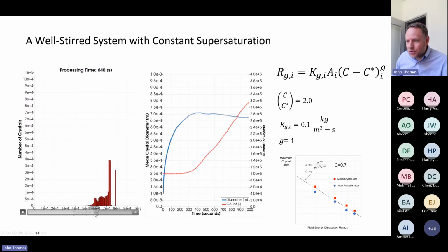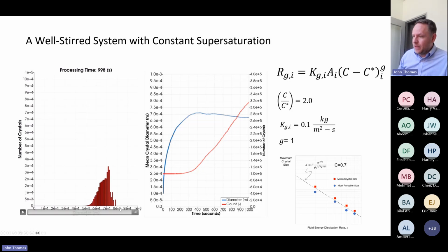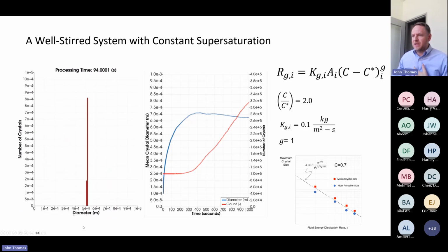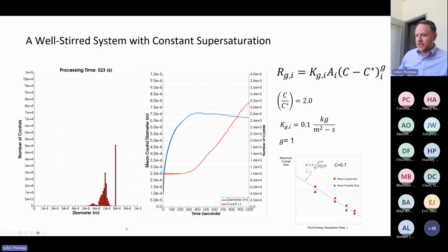And eventually we get to some sort of ceiling here. We have some sort of EDR that's capping what the maximum particle size can be inside our vessel, and that acts as a ceiling. Whenever a particle gets up there due to growth, it gets cut back down to size. Okay, and remember, this was a constant. I maintained the saturation level at a constant value here, so we're continually having some sort of feed that can be used to maintain my C star, my saturation levels.